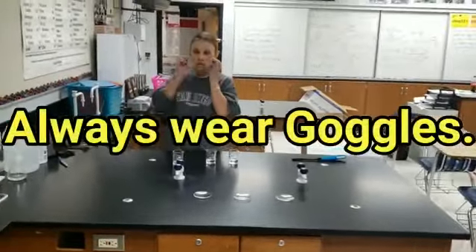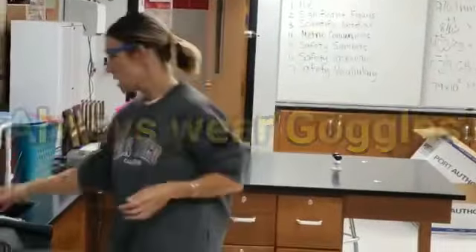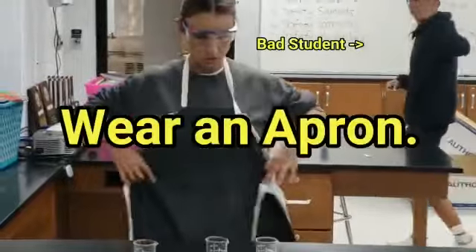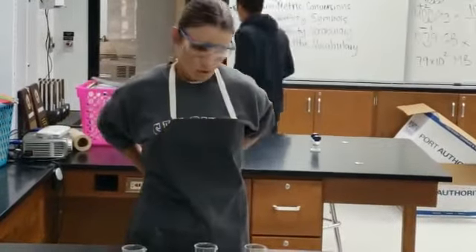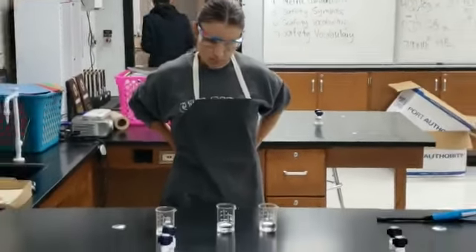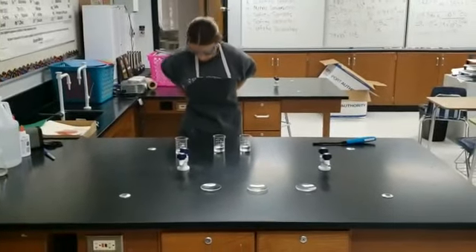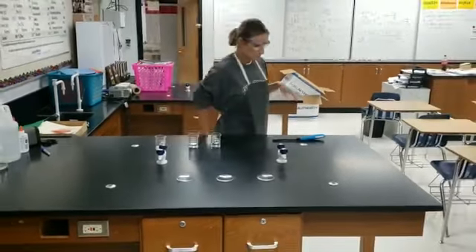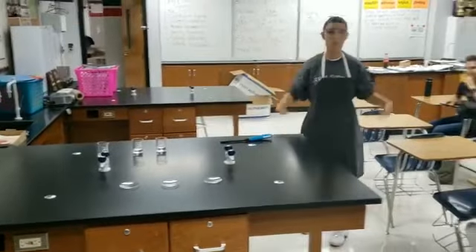Goggles are always a must. So here are my goggles. And I have to put on this apron to protect my clothes. So I'm ready to do this. Proper lab attire.